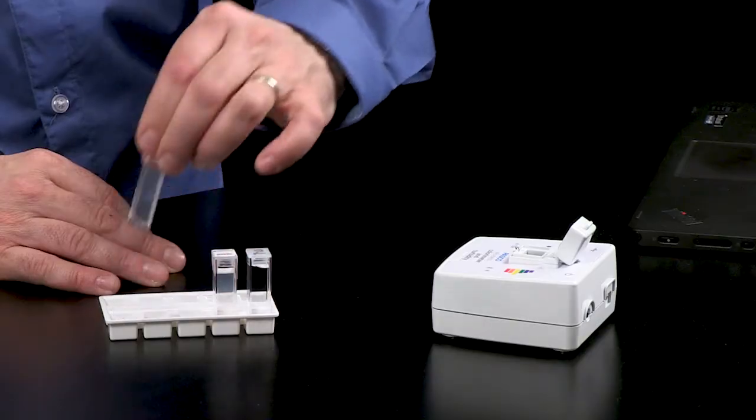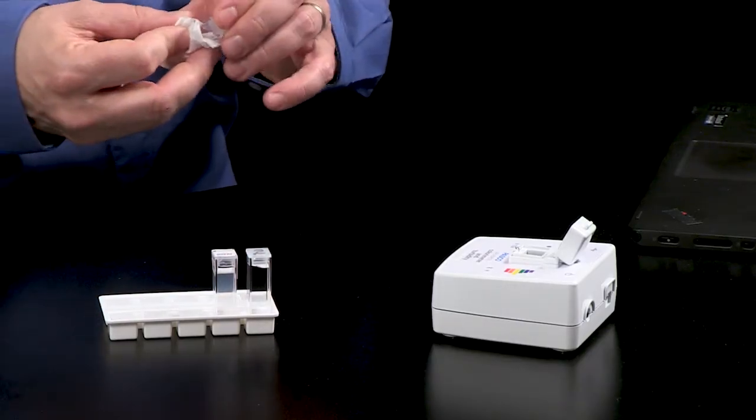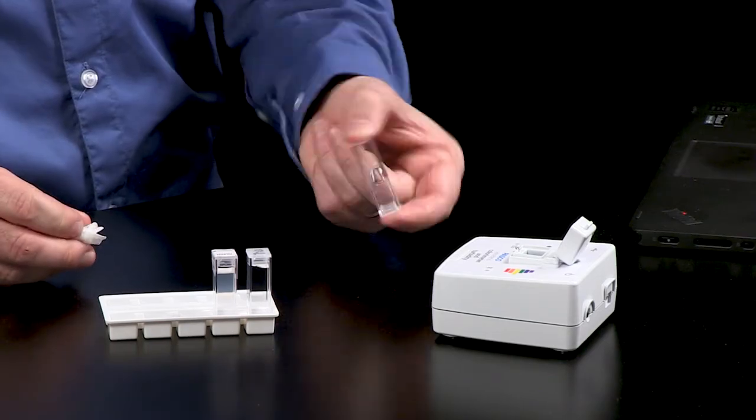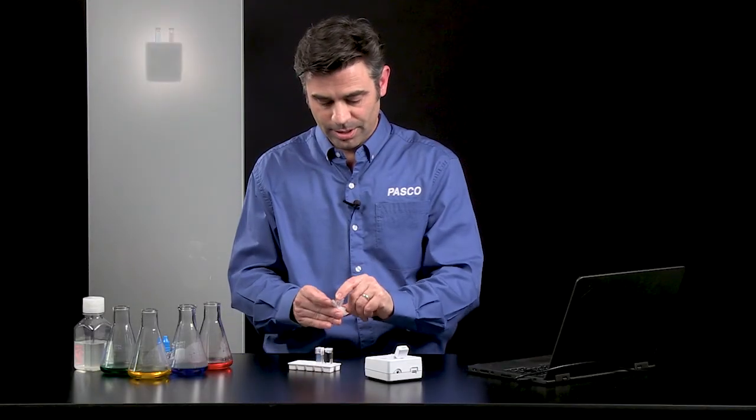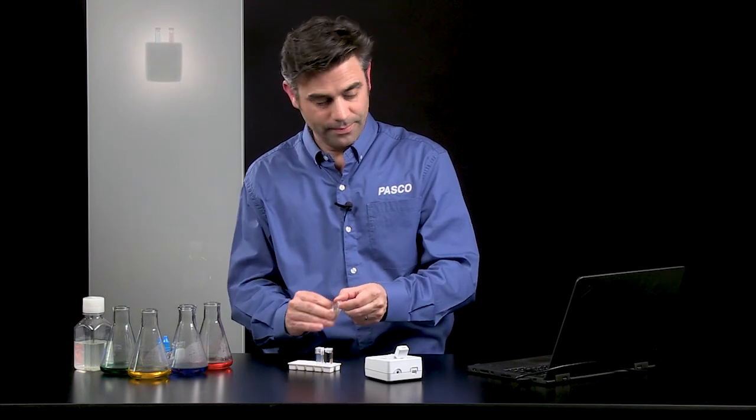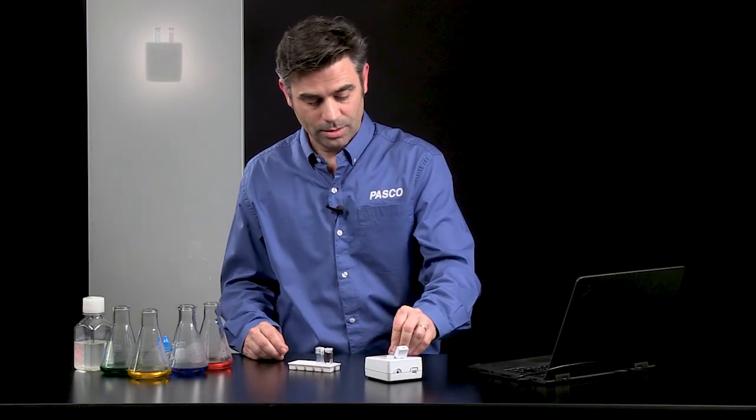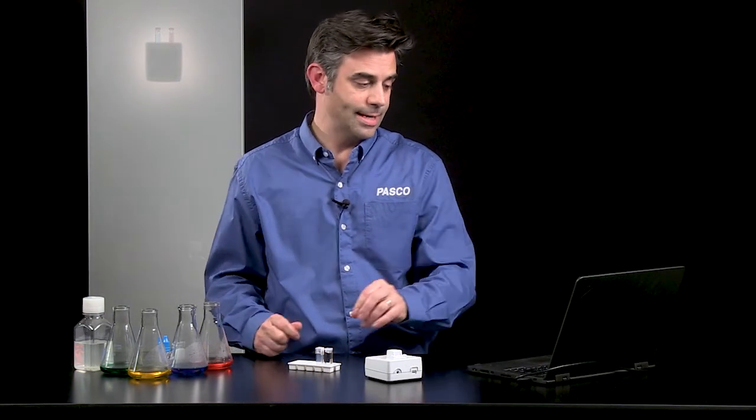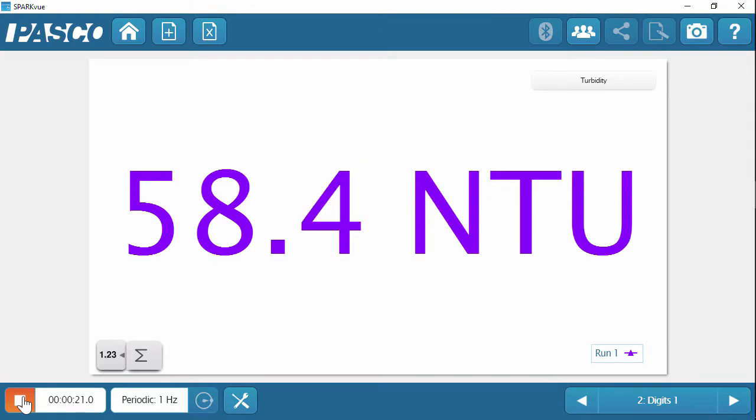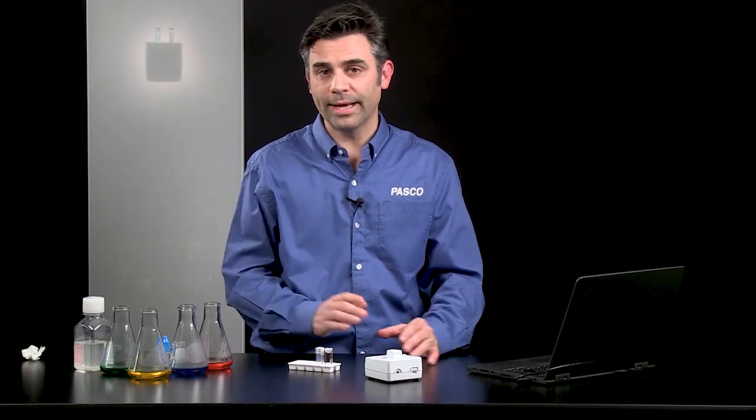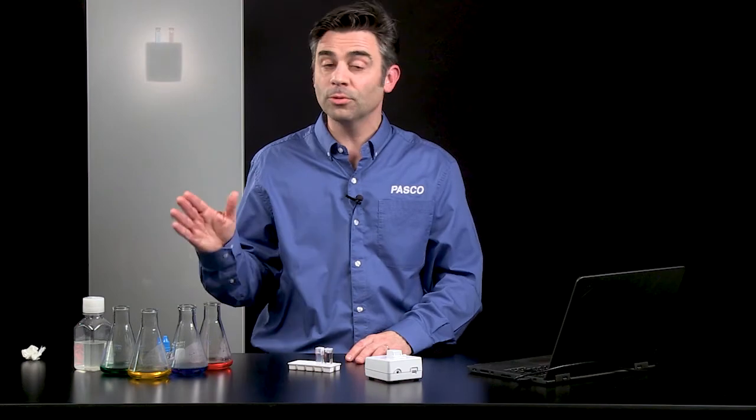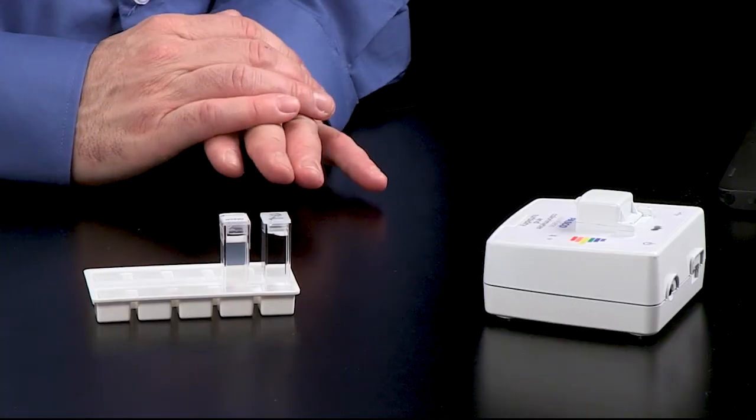I'm going to make sure this is nice and mixed according to the instructions. Make sure those sides are clear and clean. Put that in. And now I'm measuring about 58 NTUs for my unknown. The detector range is from 0 to 400 NTUs with an accuracy of about 5%. So if you are over 400, you will want to dilute your sample.